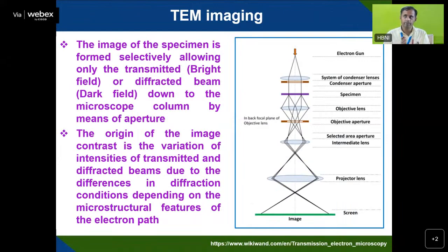So far what I have discussed is mainly how the TEM produces diffraction patterns for amorphous, polycrystalline and single crystal samples, as well as how you can identify each plane in a polycrystalline material or single crystal spots, and how a diffuse ring can be used to get the radial distribution function and information about the material. Now we will discuss the imaging part, the second part of the TEM microscope.